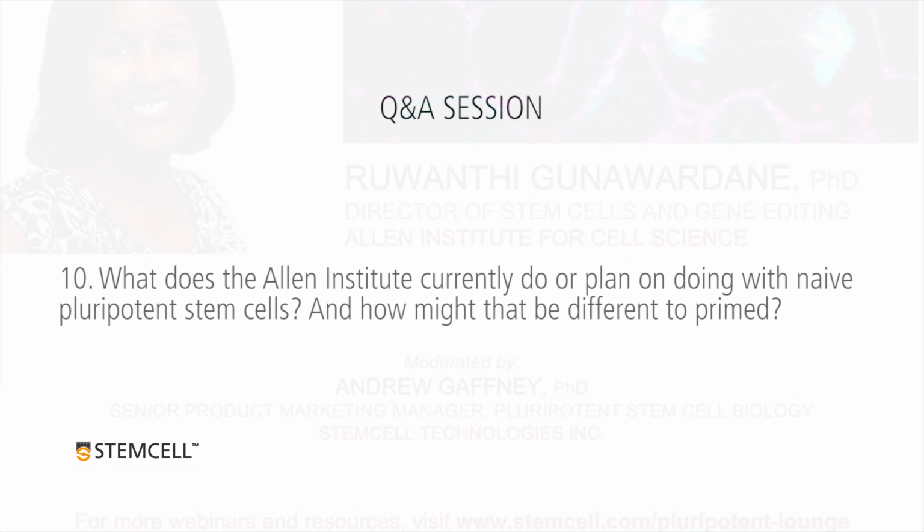Where are the organelles, especially if the naive cells are a little bit more in a pluripotent state? And we know, for example, the mitochondria in particular look very different and perform very differently in naive cells. It's one of the structures that's actually being studied. But what about the other structures? So if we have a tagged line, and we have close to 20 now, you can de-differentiate them into naive cells in addition to differentiating them into cardiomyocytes. And then we can have this broad spectrum of images to use for our modeling. So it's just very much a vision right now. We haven't actually done any work, but we have people across the street at University of Washington studying naive cells, so this might end up just being a collaboration.